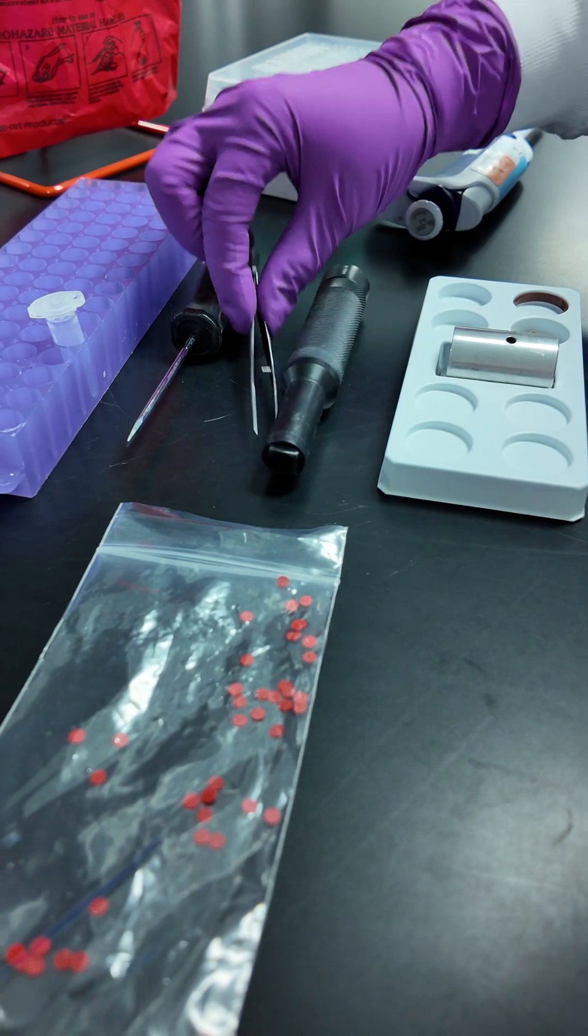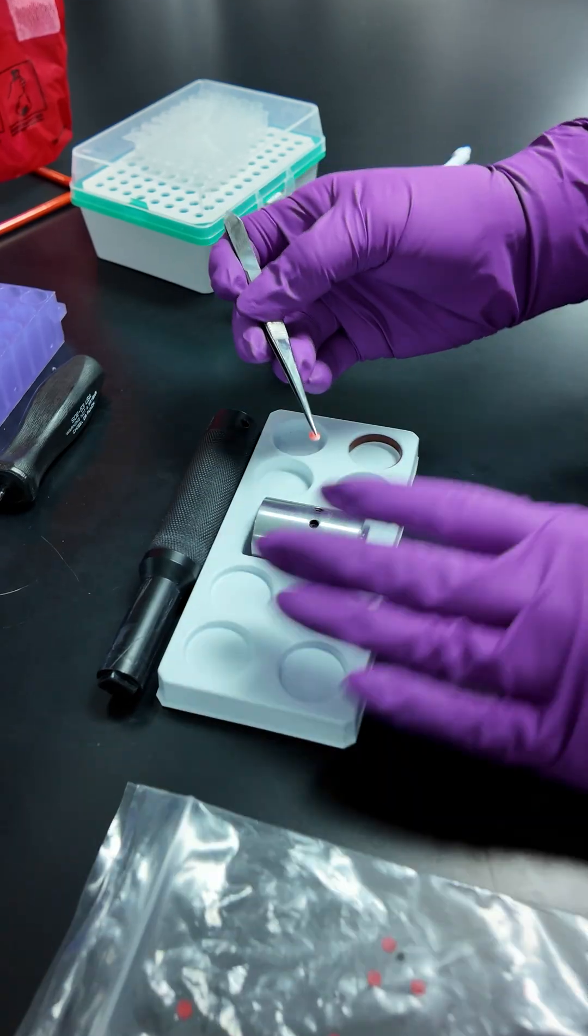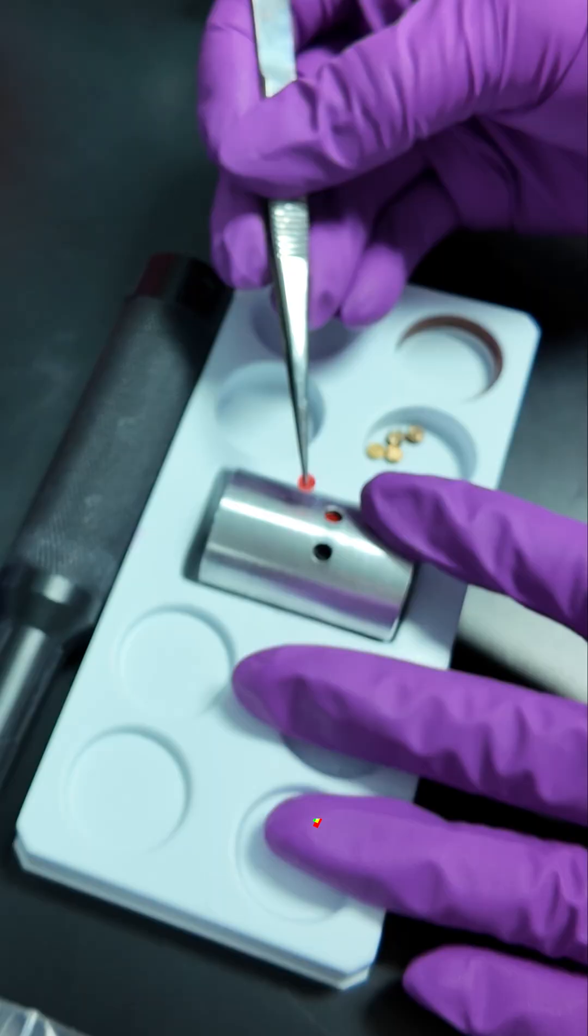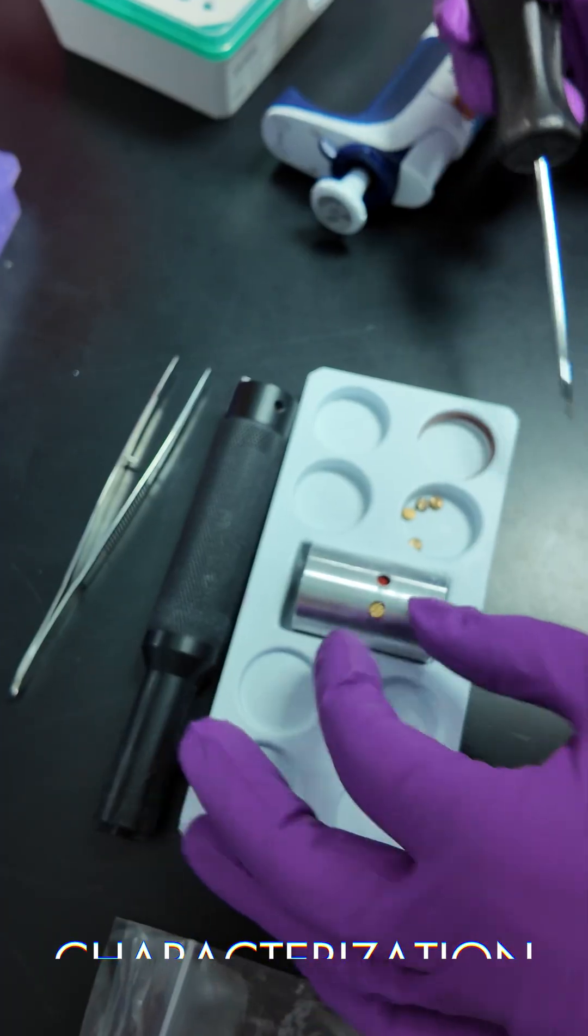We use AUC to quantify empty and full AAV classes with high precision and accuracy, allowing for empty full characterization throughout development.